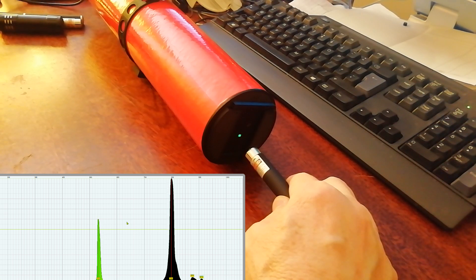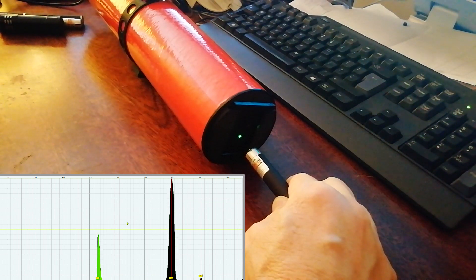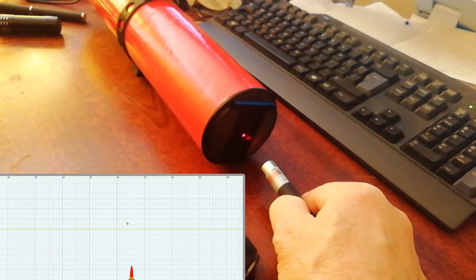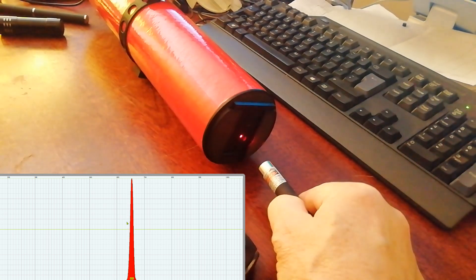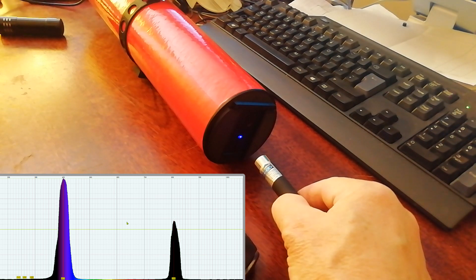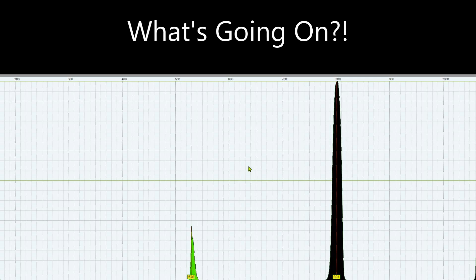Although the main bulk of the colour we can see is green at 531, far more energy is being radiated at about 800 in the infrared, and a little bit at 907 as well. The red laser is doing its job. What's going on? Why do we get these infrared peaks for the green and the violet lasers, but not for the red one?